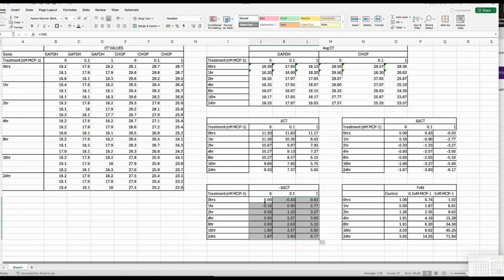For example, our reference gene, our single control gene, is 2 to the 0th power, which is 1, which makes sense because that's what we're referring to. So anything over the value of 1 means our gene is induced, and anything under that value of 1 means our gene is suppressed or brought down. So it gives us a point of reference to see what is exactly happening.